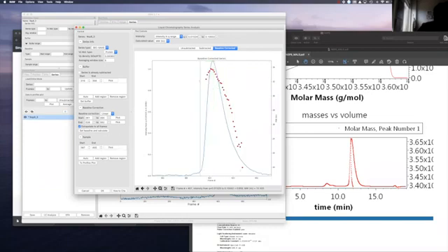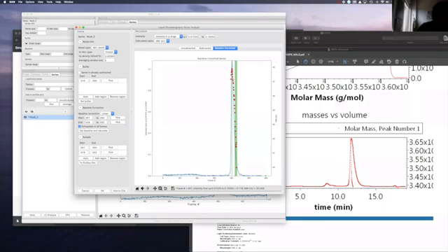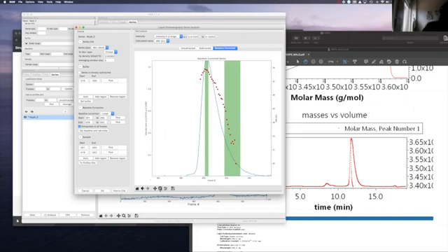Let's do it again a little bit better in the zoomed in window. Let's take just the peak with the highest molecular weight, and we can set it. Continue. Let's also select the size of the peak, and we add the region and select just the part where it is mostly the monomeric state. Just looking closely at it, let's make a slightly better selection here. We need at least some signal, because here there is no signal at all, so there will be no SAXS, obviously.